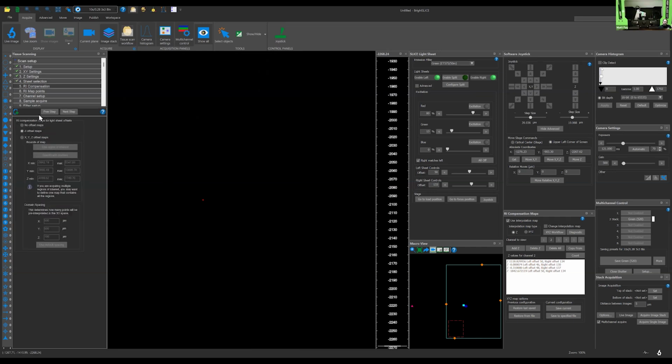This next step here is reminding us to set up one of those compensation maps. We've already set up the map, but say we were driving around there and we noticed that some points were out of focus. We can actually add or correct our map at this point. The other thing worth mentioning is for these maps, for a well-cleared, homogeneously cleared sample that has a homogeneous RI throughout it, typically, and I would say 98% of the samples I've come across fall into that category, we typically only need to do this refractive index compensation over the z-axis, over the depth of our sample.